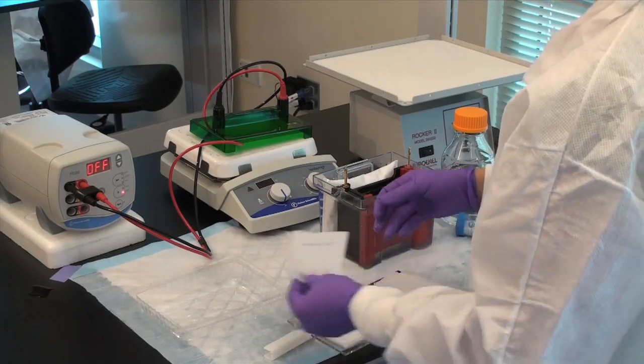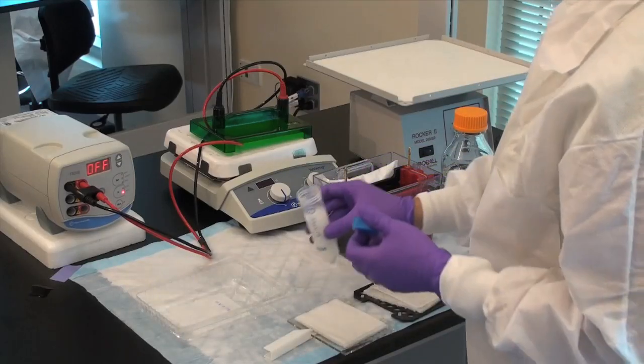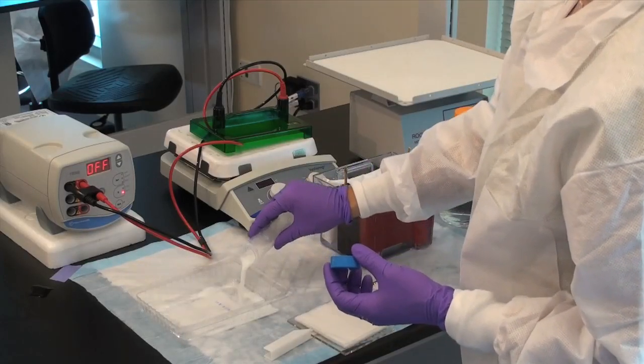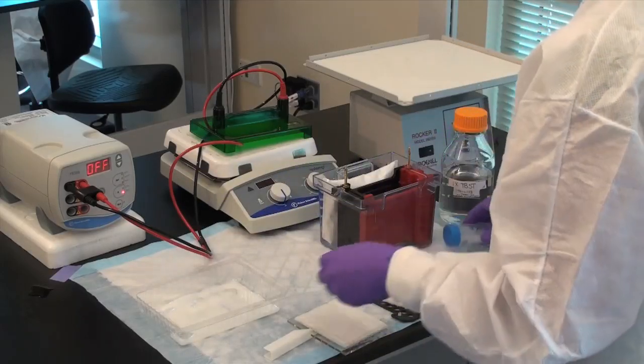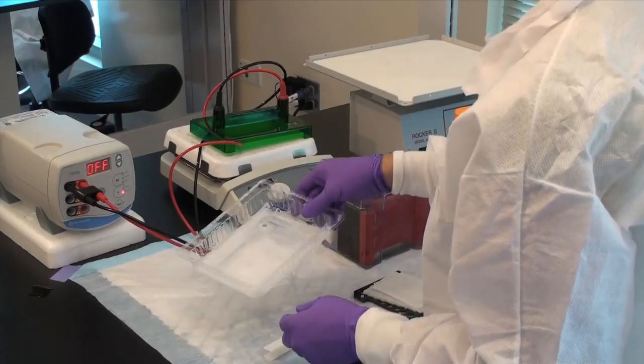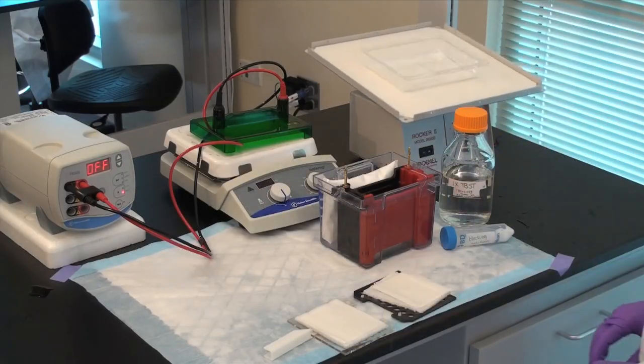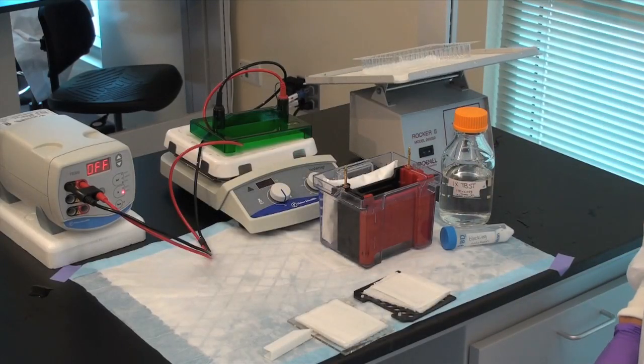Place the membrane into a small tray and add blocking solution. This is typically nonfat milk or BSA made up in a detergent containing buffer such as tris buffered saline with tween 20, TBST. Let this shake for about one hour at room temperature or overnight at 4 degrees Celsius.